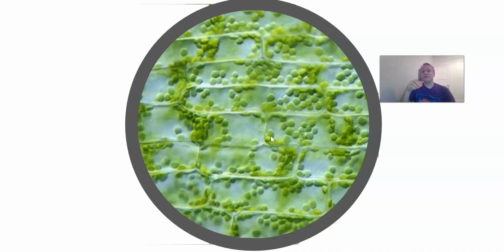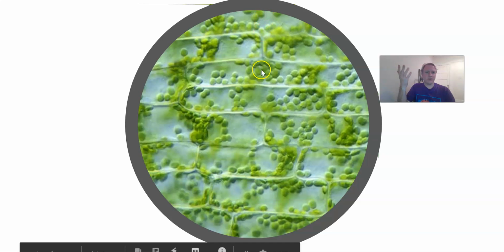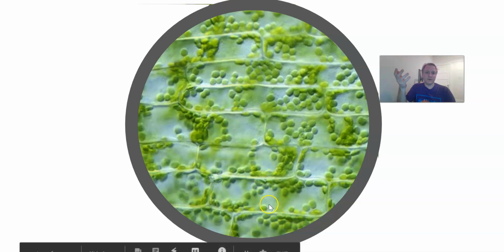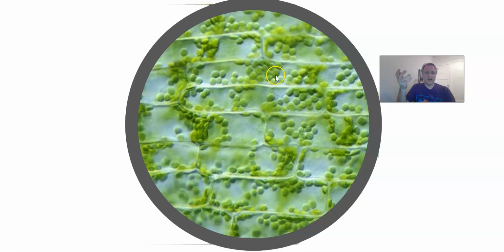Okay, and you can do the same sort of thing if you're estimating the width of a hair. So, how wide are these cells? Well, it's a circle, so this is about 5 mil as well. So I've got 1, 2, 3, 4, 5, 6, 7, 8. So 5/8 of a millimeter. You could do better math than that. You should do better math than that, actually plug those numbers in.